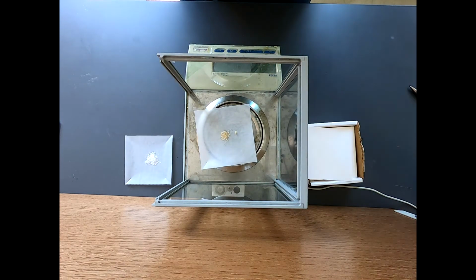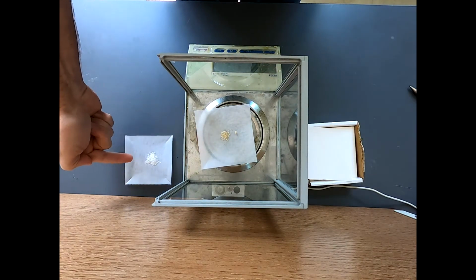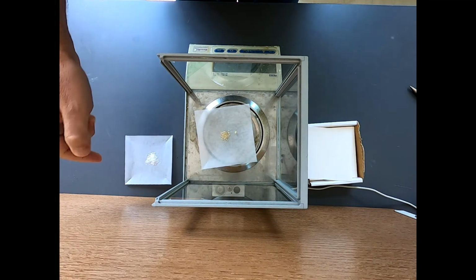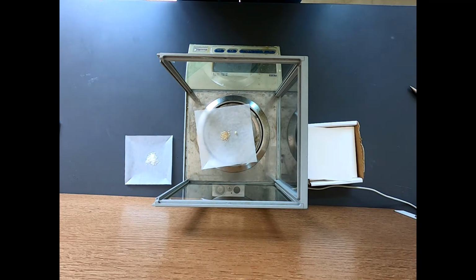So that is just a hair under a millimole of our hydrazide, and we were a hair over for our cycloadduct. That's good. We want a little more of this than that in terms of purification and isolation. Okay, so that's it. So let's take these into the hood and get started.